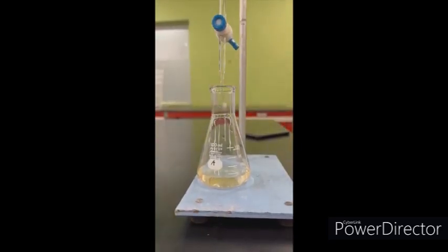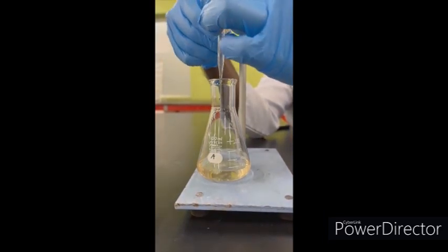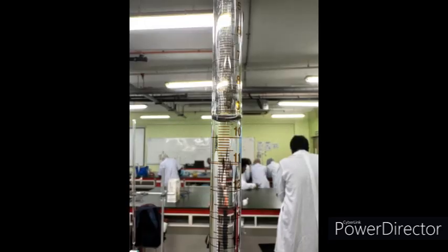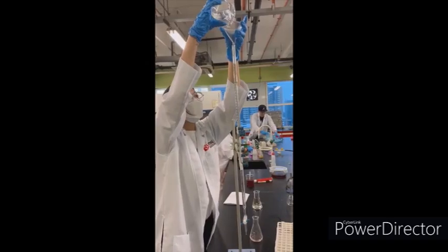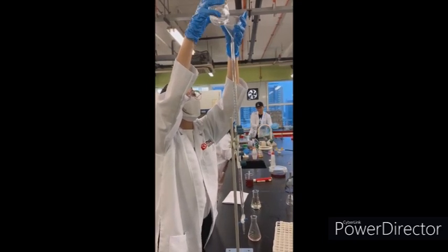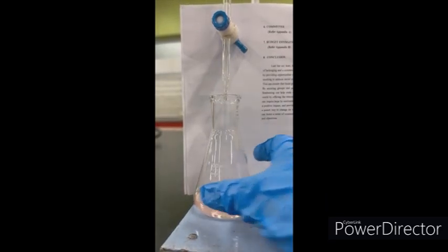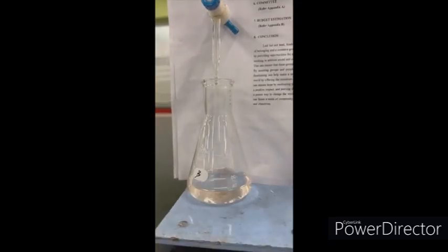As we can see, it's a bit more colors compared to the pinkish color seen as before. We decided to close the burette as the color had turned lighter pink and getting colorless inside the conical flask.